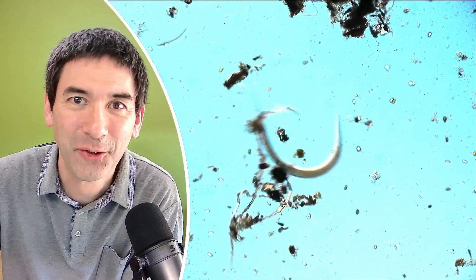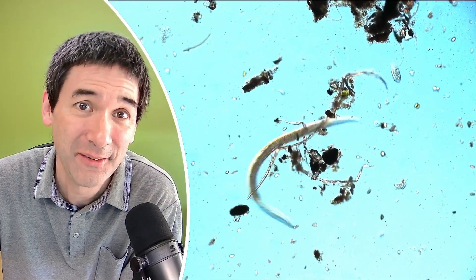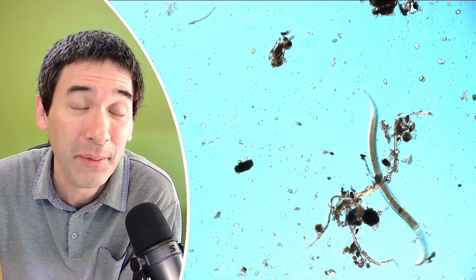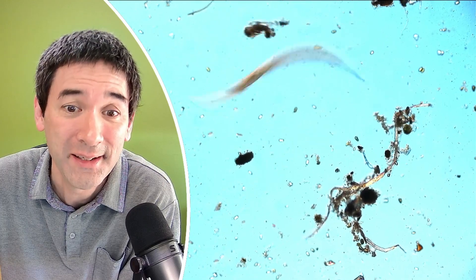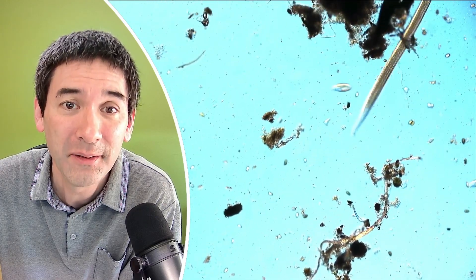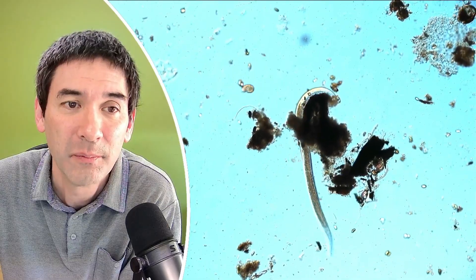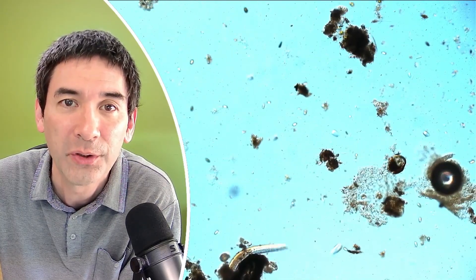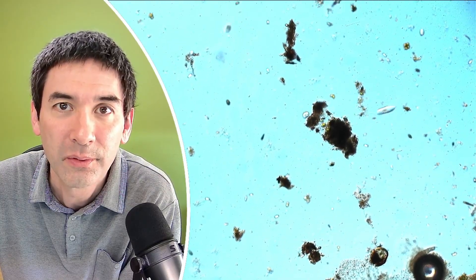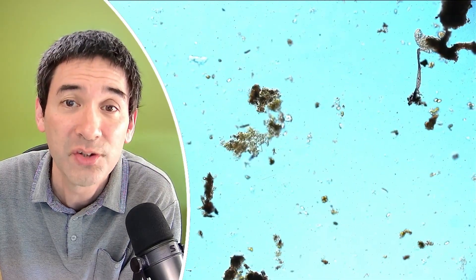I can confirm there is plenty of life present here. This here, for example, is a nematode worm — somehow it must have survived the dryness. But there are many other interesting creatures, also lots of single-celled organisms — protists. You can see there's quite a bit of movement going on here. Over the last couple of days, the cells that did survive were able to reproduce, and this is where we are.